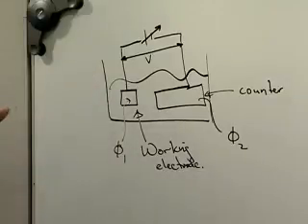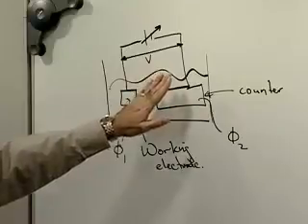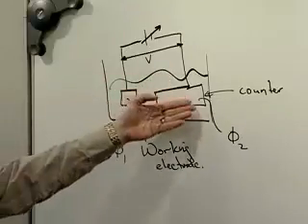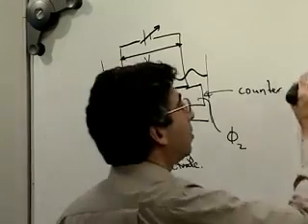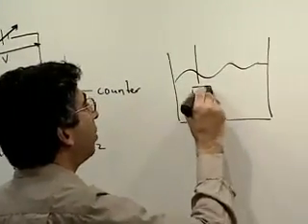Now, of course, for the situation I've drawn there, that is never going to happen, because in order for the potential to distribute evenly around these two electrodes, the two electrodes have to be identical, and the two interfaces have to be identical. And you can see I have a huge electrode over here and a small one over there. So I go back and I whip out my platinum again, and I cut some new electrodes. And I do the same thing, but now I have two identical electrodes.